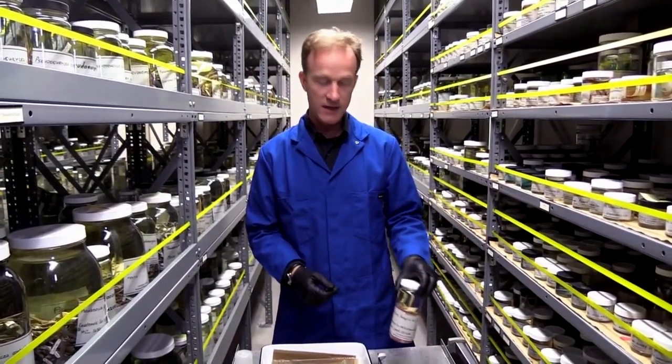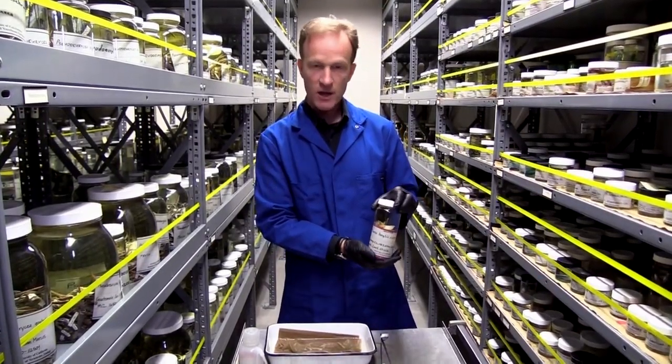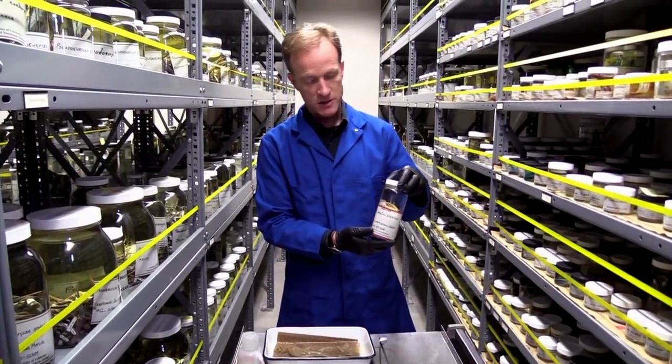My name is Vance Riedenberg, and I'm here at the Museum of Vertical Zoology in Berkeley, California. I'm going to show you how to collect a skin swab from a museum specimen.